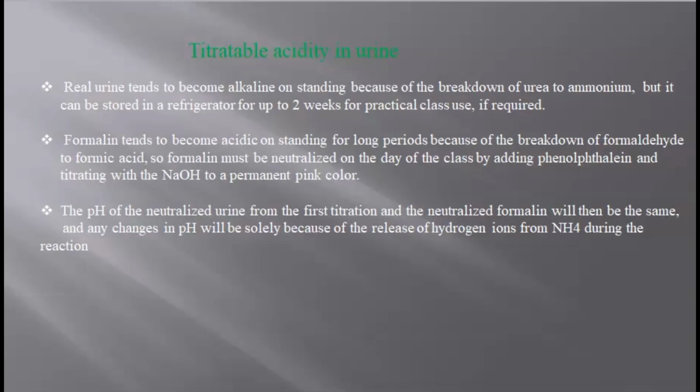If there is a change in pH, it will be solely because of the release of hydrogen ion from ammonium during the reaction. So the pH has to be the same. There will not be a change in pH. But if there is, it means ammonium has released a hydrogen ion in the course of the reaction.